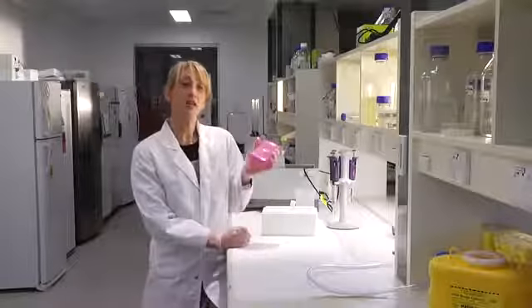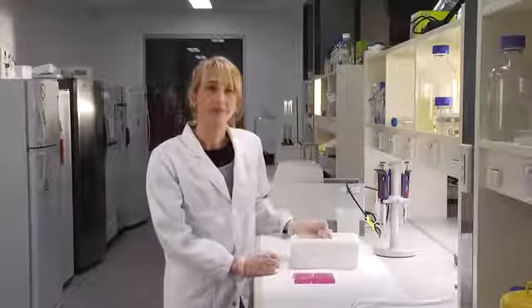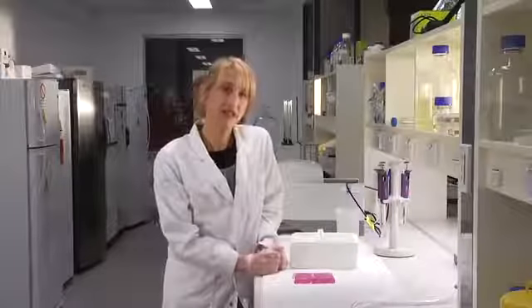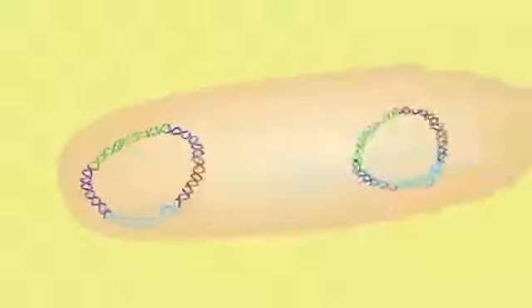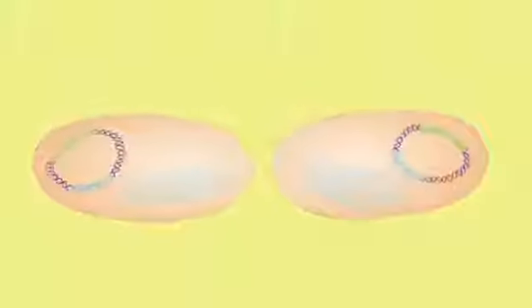Now that we've incubated this overnight, our ligation should contain some plasmid molecules with the insert in it. In this case, the insulin gene. But we're also going to have some plasmid that hasn't been able to ligate successfully. And we need a way to sort out those bad guys from the good guys. Well, we'll use bacteria. Each bacterial cell will take up one plasmid molecule from our ligation mixture and replicate it so that we can analyse each one separately for the presence of the insert.